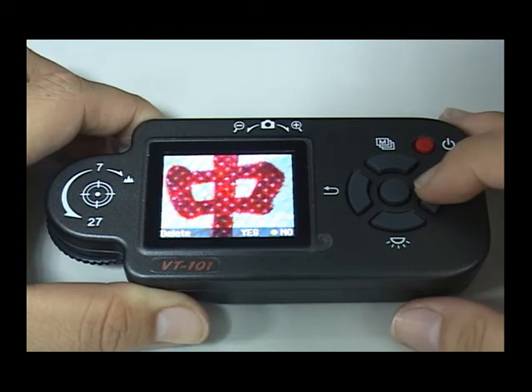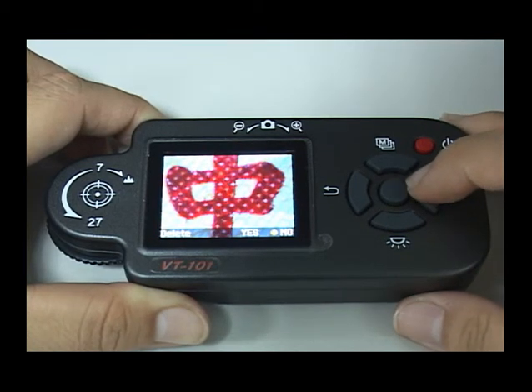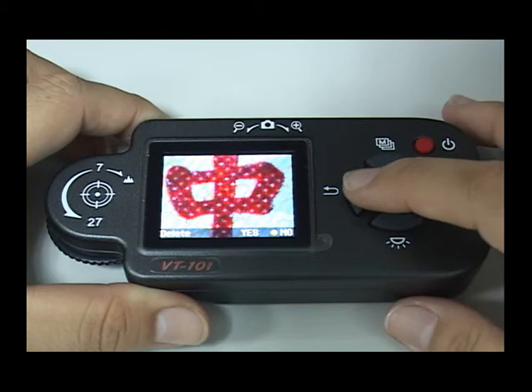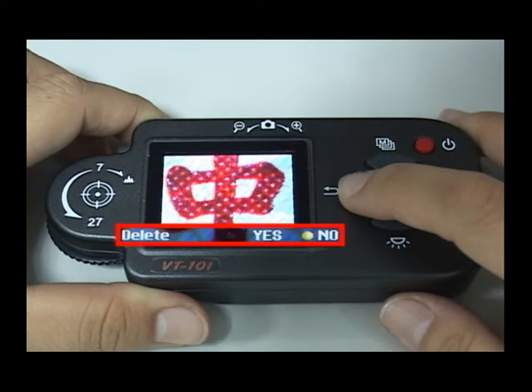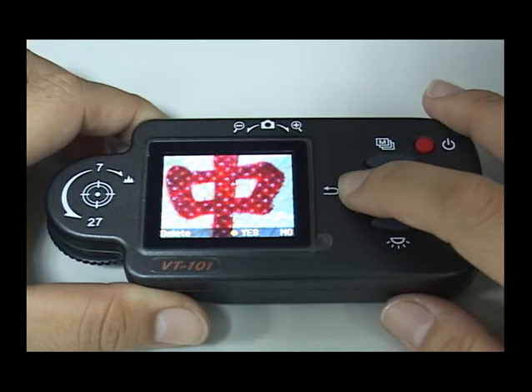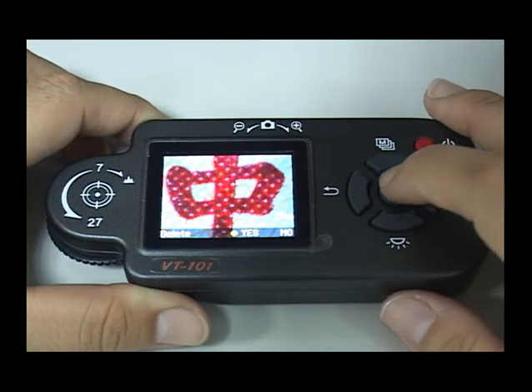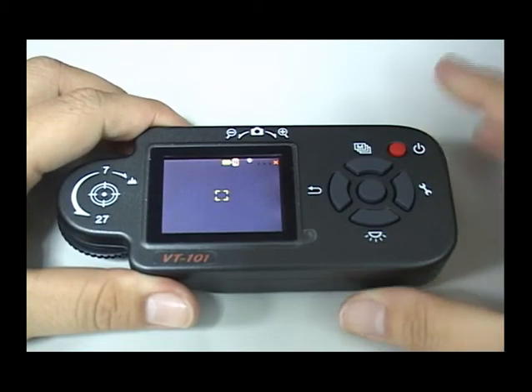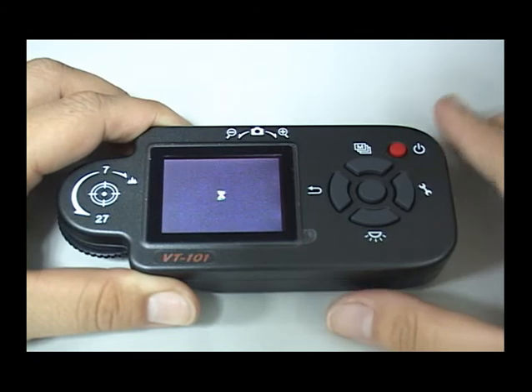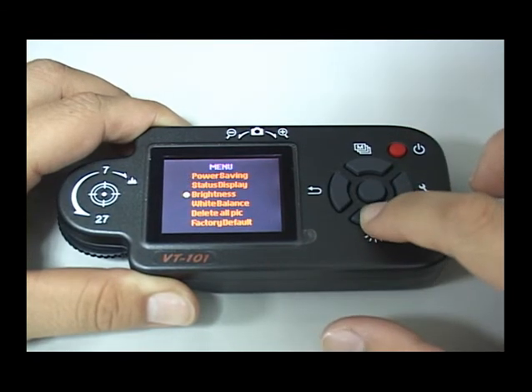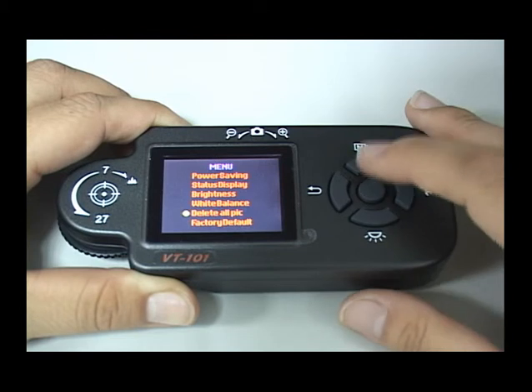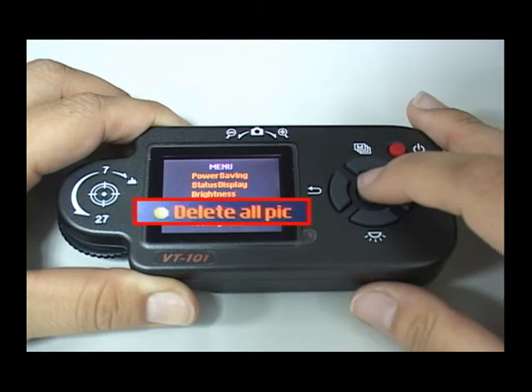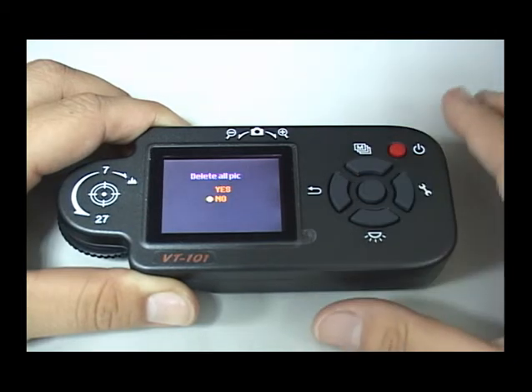In viewing photo mode, press the right button and it will ask you if you want to delete the photo. If you press yes, the photo is deleted. When you want to delete all photos, you can press the right button to enter menu mode and choose delete all pictures.